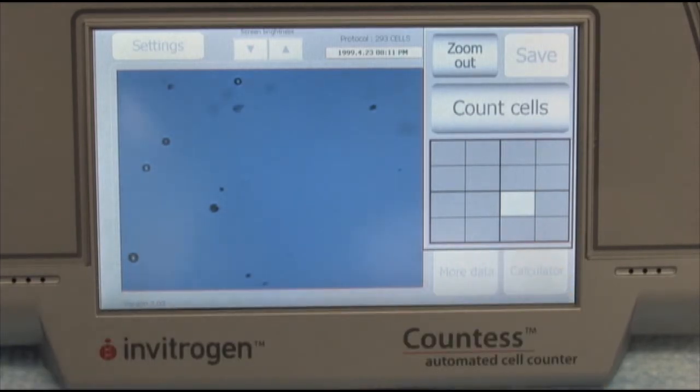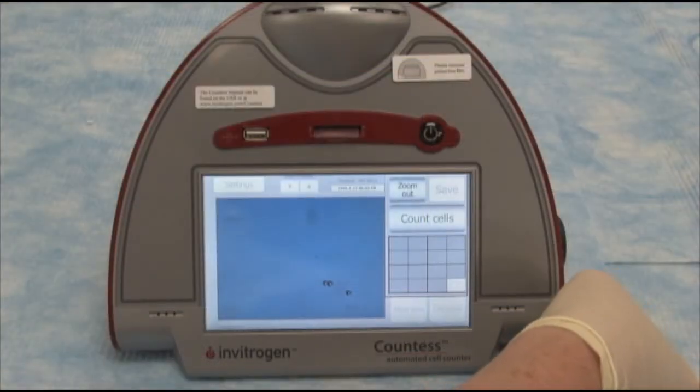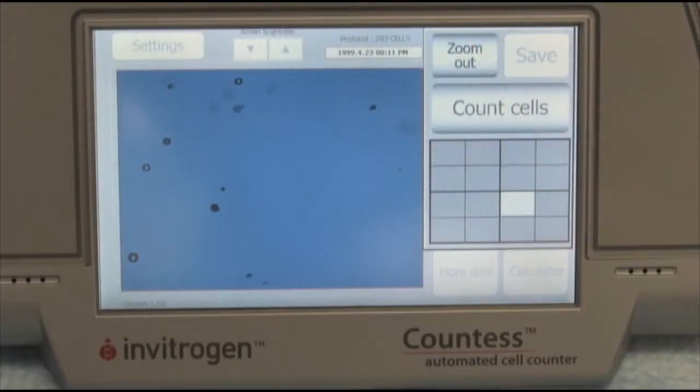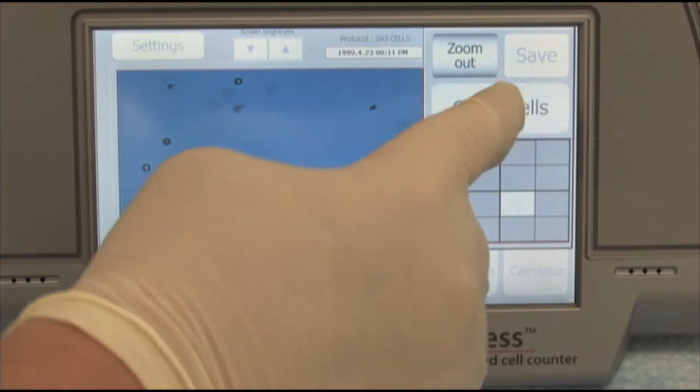Then, using the focus knob, I can unlock the focus, as so, and then focus in. After I've focused in, I'll hit count cells.